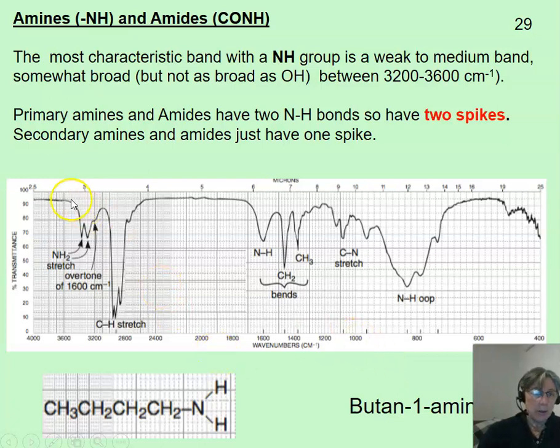Okay, so we've got used to having OHs here, and our carbonyl here. So now we need to add a bit of complexity to it. We can have an amine here, which is all very fine if they give you the formula and it's just got carbons, hydrogens, and nitrogen, then you don't have to worry about an oxygen. That helps, doesn't it? If you've got an amide, though, C double bond oxygen and an NH, then you're kind of wondering what's going on.